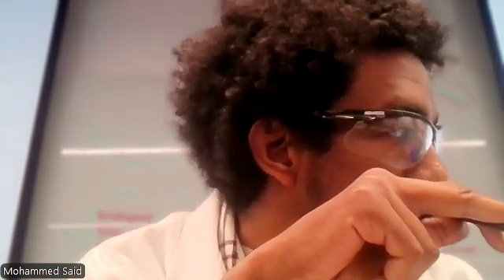Now, let's go straight ahead. We'll be going through the different slides and talking about what today's exercises will include briefly. Starting off, as I mentioned earlier, we have the streak plate method. We're going to differentiate this from the spread plate method we did last week, since that will be what we're starting off with first for today.